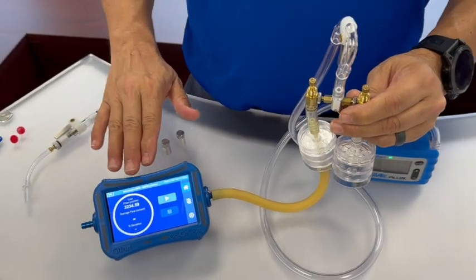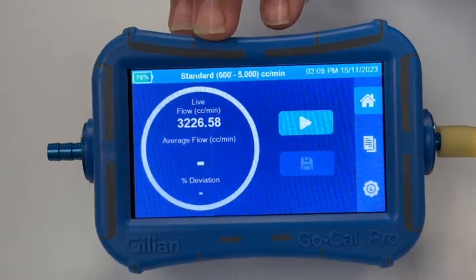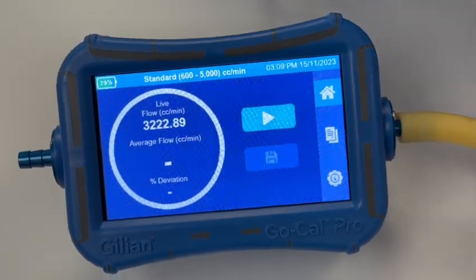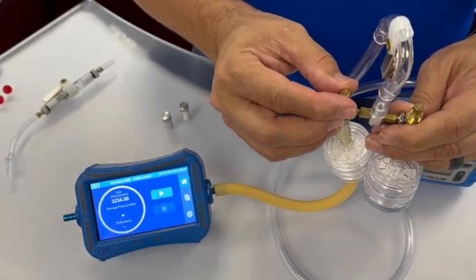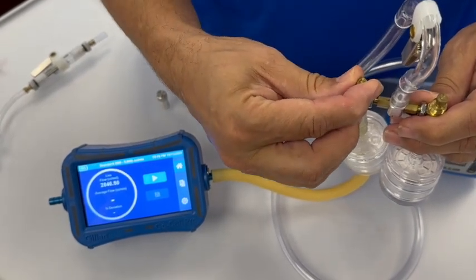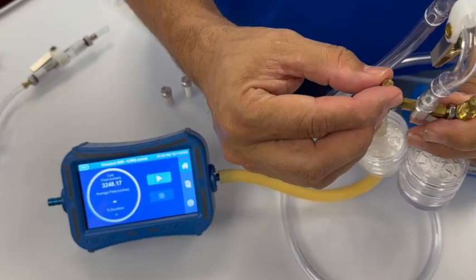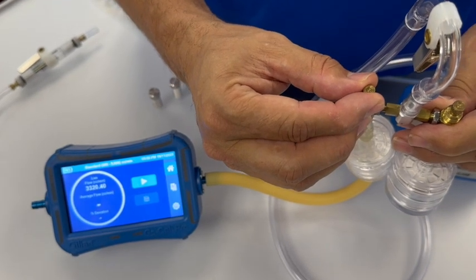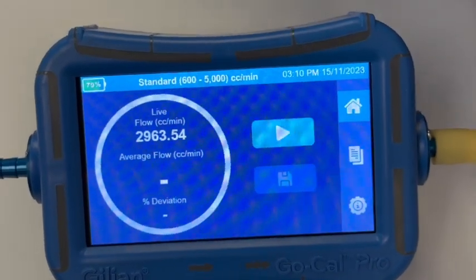Now let's take a quick look at our calibrator's live readings. This will give us an indication of the flow rate being pulled through the filter cassette. We can turn and make adjustments to the set screw — clockwise to decrease the flow and counterclockwise to increase it — making very small adjustments to fine-tune it to our desired flow rate.